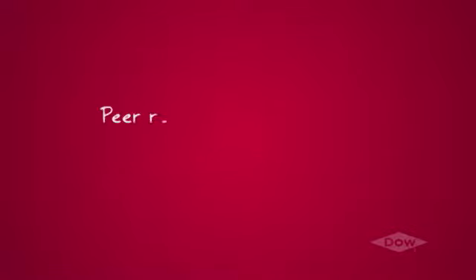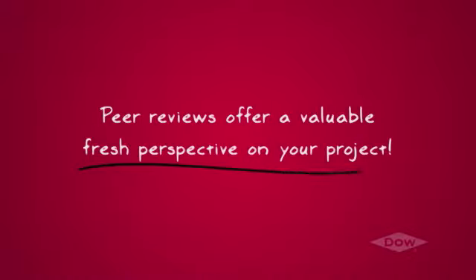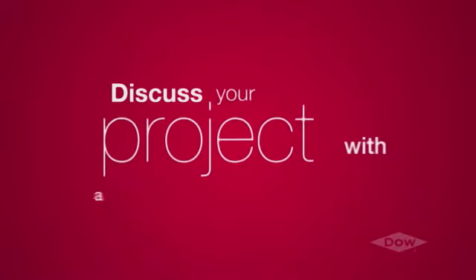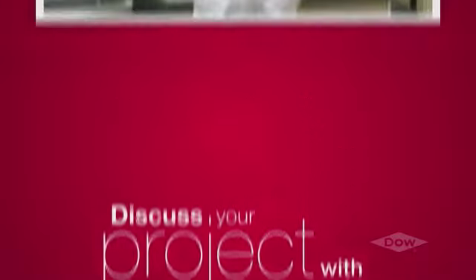Now, as promised, let's talk about peer reviews. In some cases, a peer review may be necessary. It provides an opportunity for you to get valuable input from experienced and expert colleagues. By providing a fresh perspective on your work, peer reviews can offer additional safety suggestions or advice to help you further diminish hazards. You should always feel comfortable asking a coworker to discuss your project with you, even if a peer review isn't needed. By working together, you can better assess potential risks and ensure safeguards are in place.